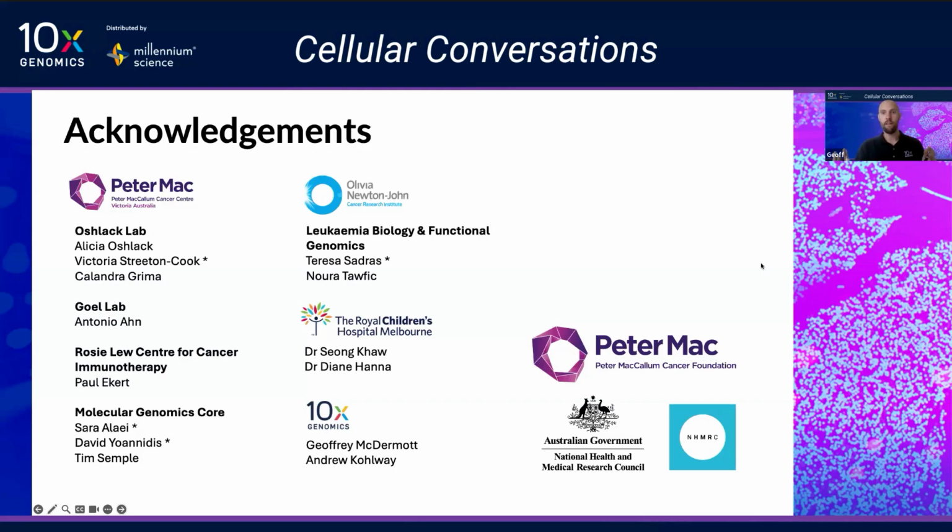Could you do it on a spatial platform? Most certainly as well. So to add a little bit extra context there, what we saw here was obviously single cell, where we have two 25 base pair probes that land on a target, and then we ligate that together to form one 50 base pair probe.